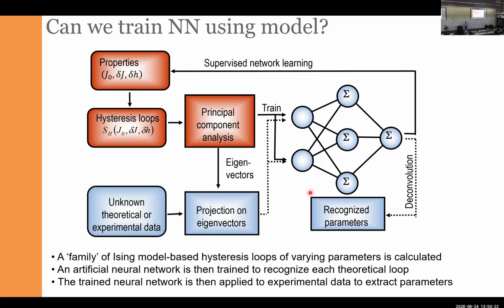So in many cases, we can have a situation that when our data is noisy, we can fit the model reasonably well, but the model parameters would be uncertain. So this is the case when we have a large noise level, and therefore we don't see the difference between the data and the model.